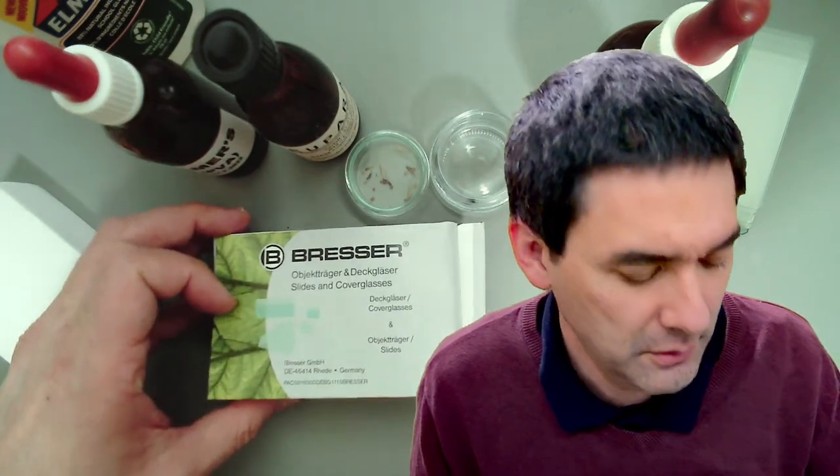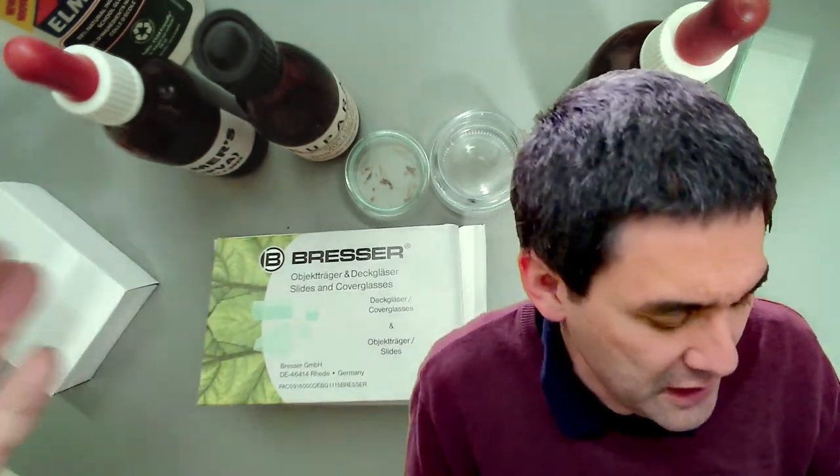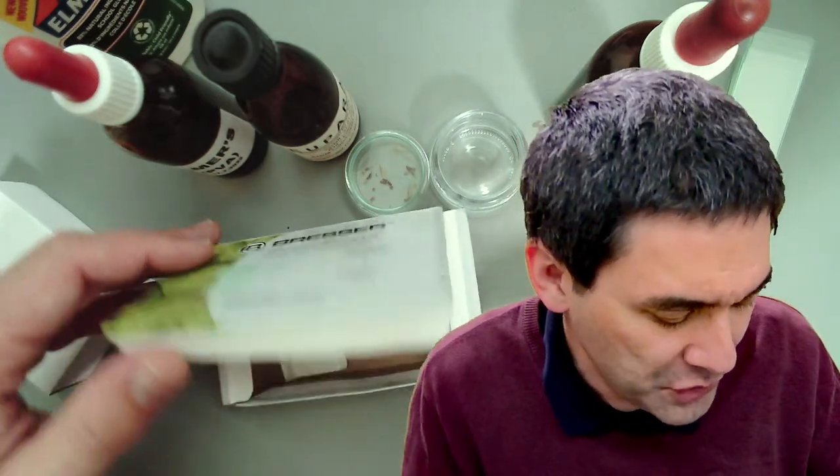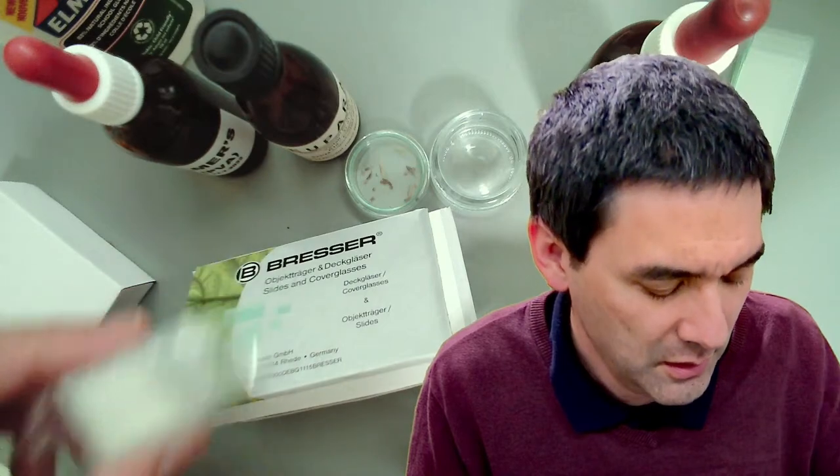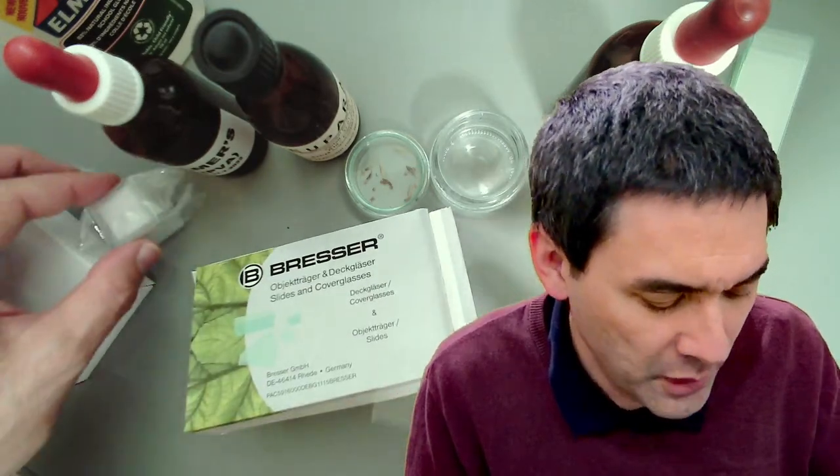It looks like this. Okay. But I'm not saying that these are the only ones. But they came also with some cover glasses. They were not the cheapest ones though. But what I'm doing is I'm actually reusing them.